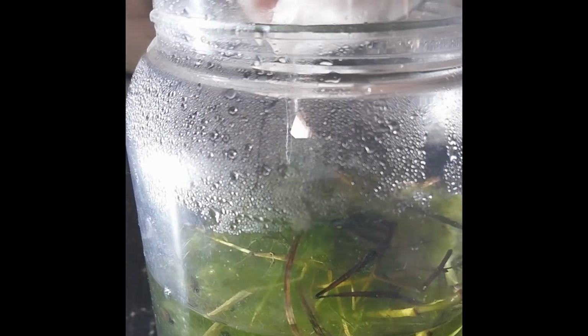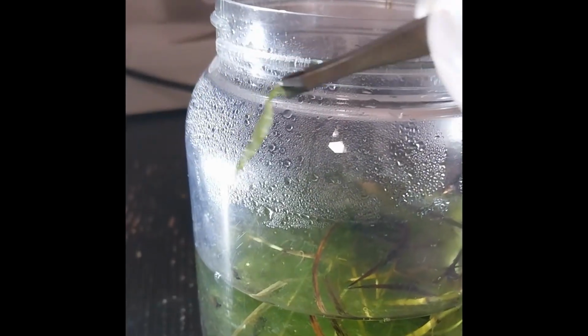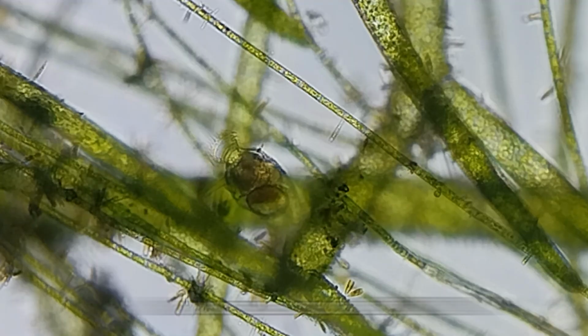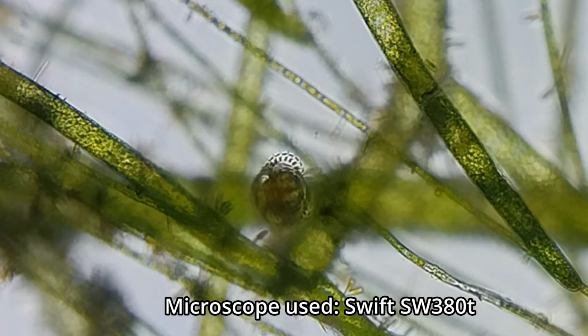Now, let's observe one slide of material from each sample and see what we can find. In the first sample, we can see a lot of macroalgae. And we can also see a rotifer attached to this macroalgae.